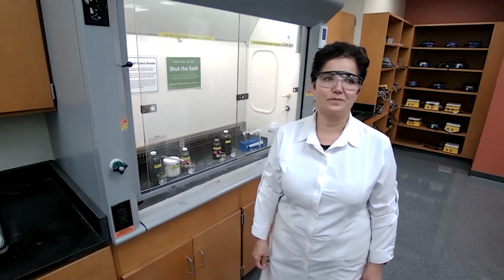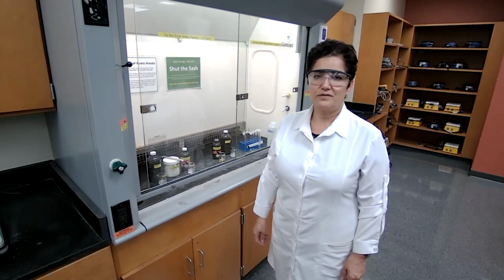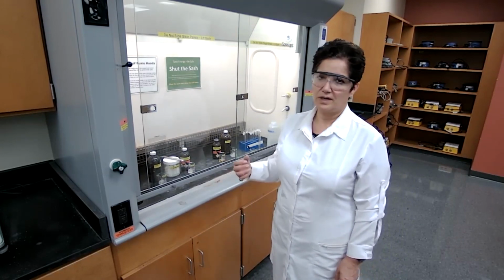Memari again with another experiment. This experiment is about determining the functional group of unknown samples. To determine the functional group, there are different ways that you could approach.